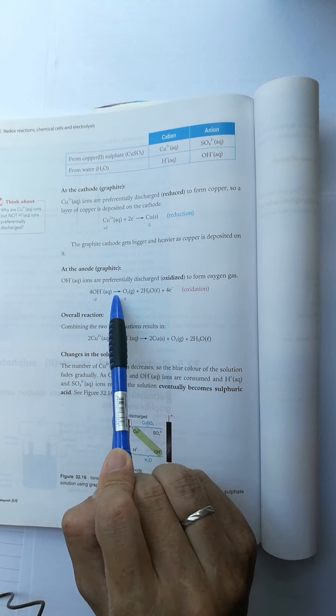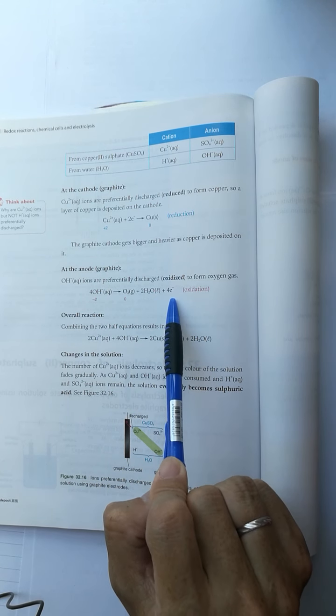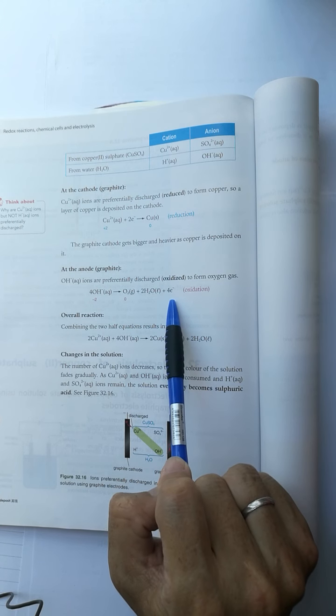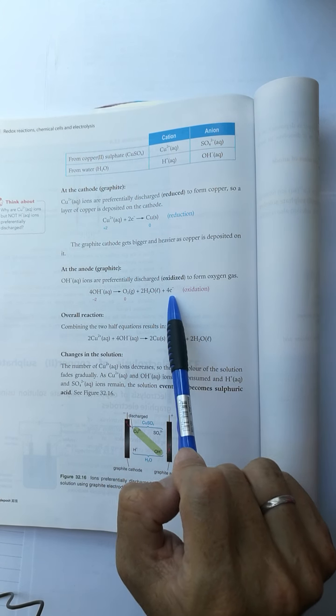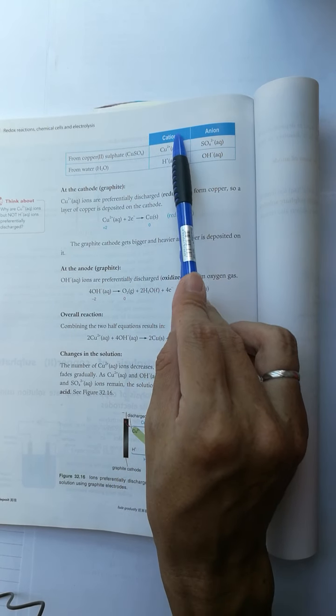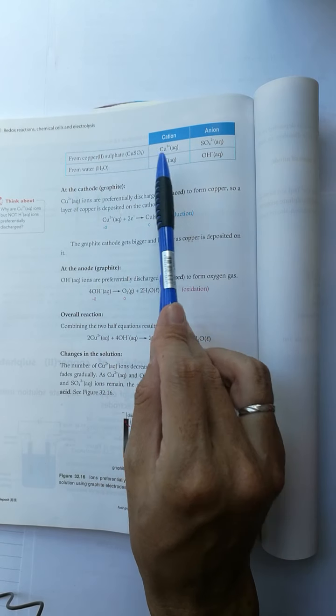Four hydroxide ions form oxygen and two water molecules, releasing four electrons. Then consider the cations—they go to the negative electrode.